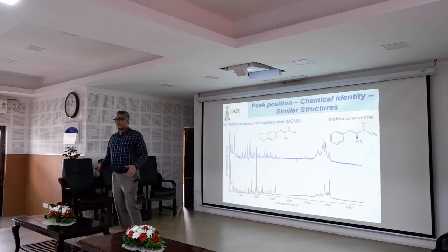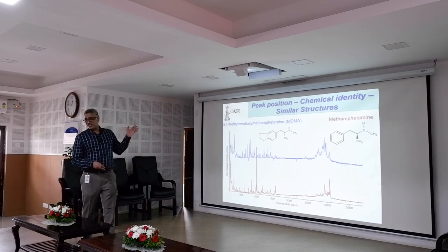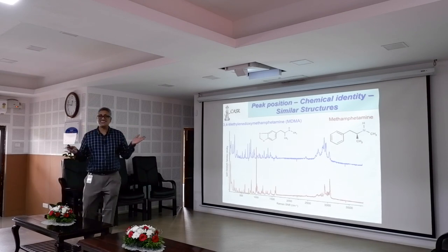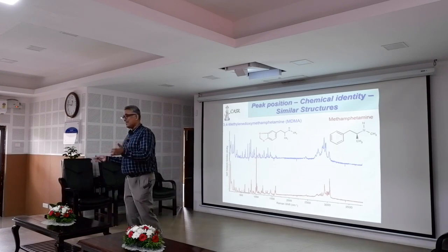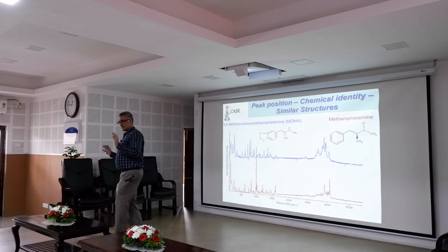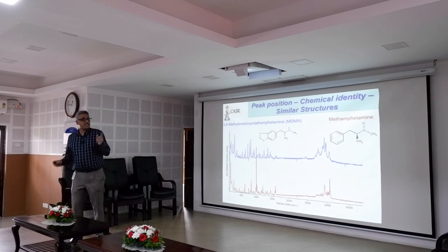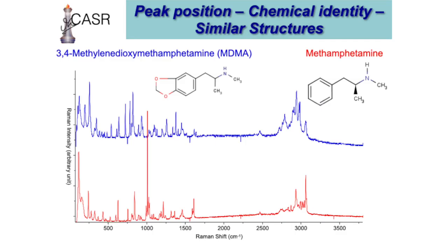Okay, next. You all know, today we are talking about this every day. You know what that is? MDMA. It is in the news everywhere. Drug. Ecstasy. Right? Most of the children in Kerala are now in trouble because of this. Now, how do I actually distinguish these two molecules? This is the original molecule from where this is made. Now, this is my starting compound and this is my MDMA.